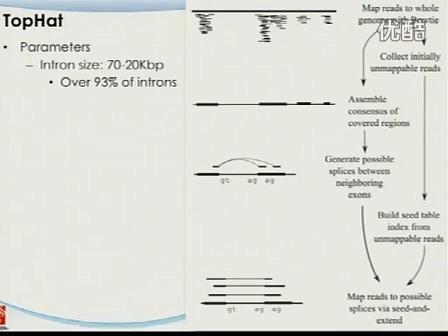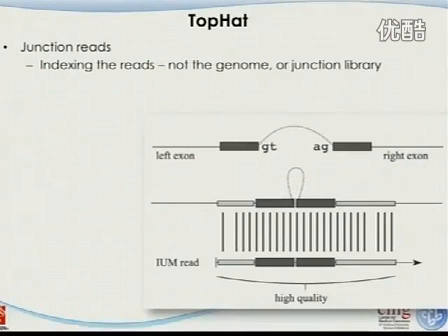And the next step is, based on this, you construct your new exon models. Then for the remaining reads that were not mapped in the first stage, you map those across these junctions. That is the way people are doing it. For the unmapped reads, one thing I want to point out is they are not indexing the reference. Rather, in this step, they are indexing the unmapped reads and trying to map them against the genome. But those are trivial issues.